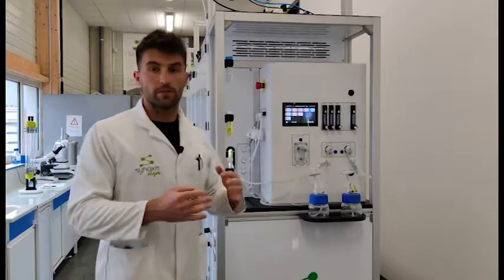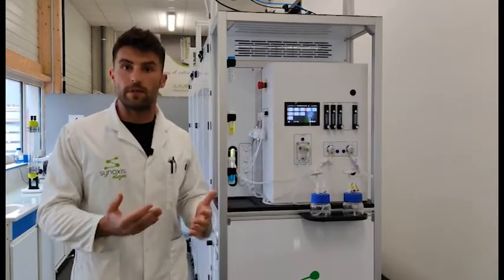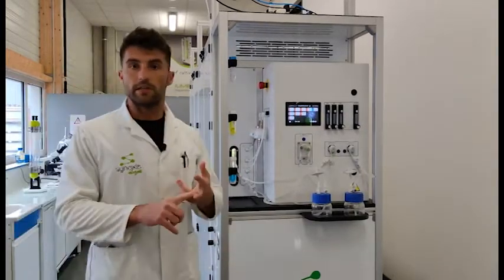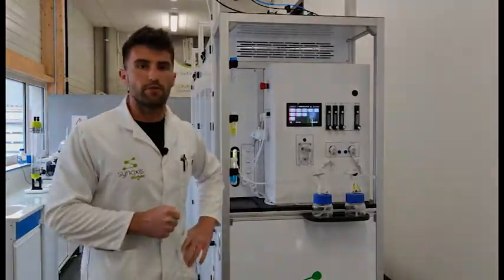It's a nice thing because if I want one day to change the algae or the species, I can do a CIP, also called cleaning in place. With chemical products, I will clean both the organic and inorganic matter, and the day after I can come back and inoculate my photobioreactors without doing anything, without disassembling anything, and that's something really great in the lab.